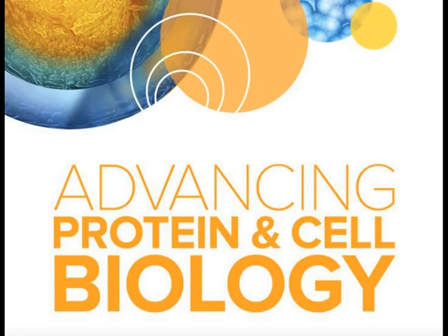So I can either get average value per well, or I can get individual intensities of individual cells. It is also possible to get other intensity measurements like integrated intensity or intensity of the entire spheroid as an object.